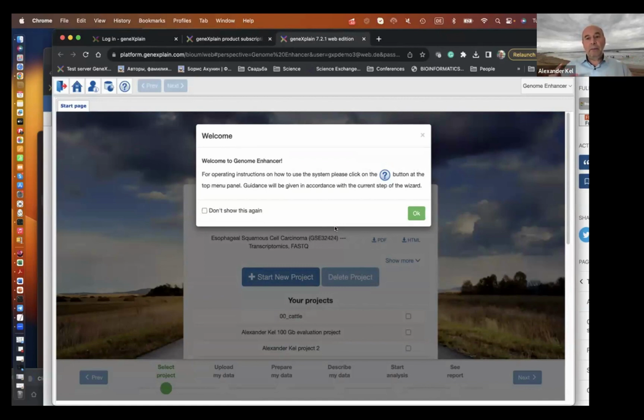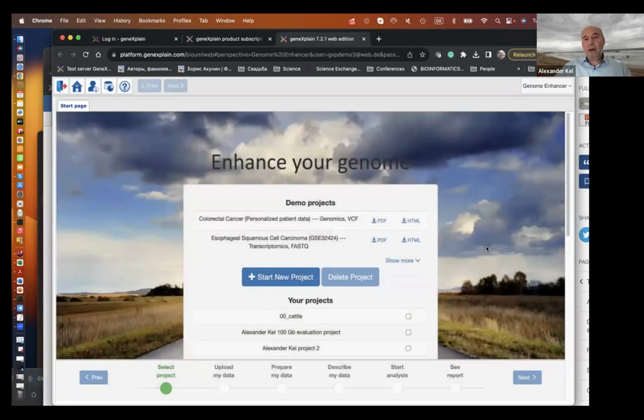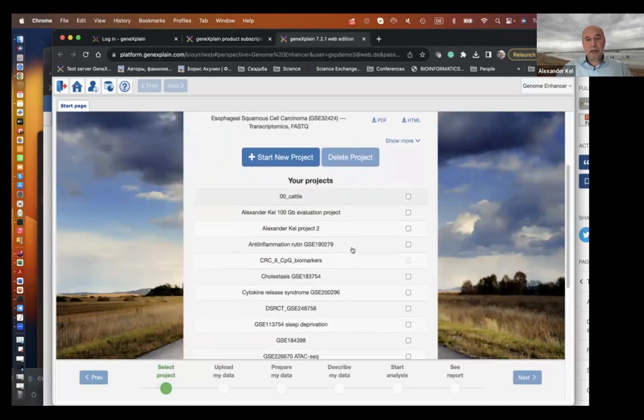But then what happens is, you just put this data in this tool, and it will know how to combine epigenomic data and gene expression data. If you put in transcriptomics and proteomics, it will know how to combine those. If you put in all kinds of other types of data, we'll talk about that maybe in the future. But today our topic is really epigenomic data, ATAC-seq data.